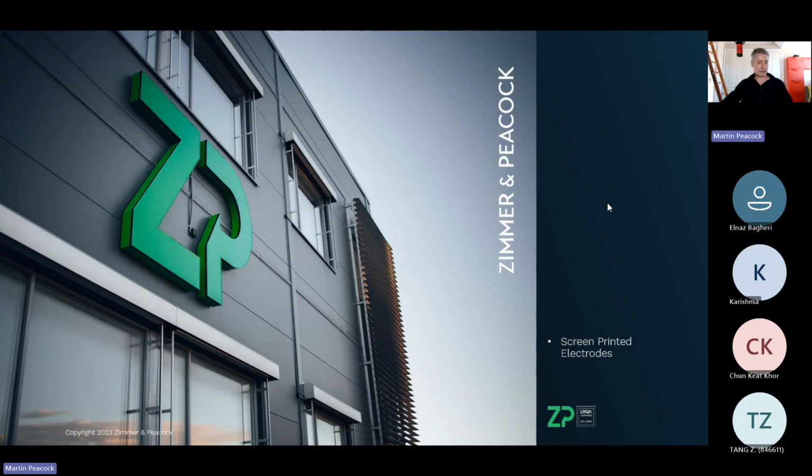So this is a ZP live streaming webinar discussing screen-printed electrodes, but we've got lots of demonstrations as well. I just want to share a screen with you, or a camera with you rather, to give reassurance that this is not your typical webinar with just slides and people talking in theory.